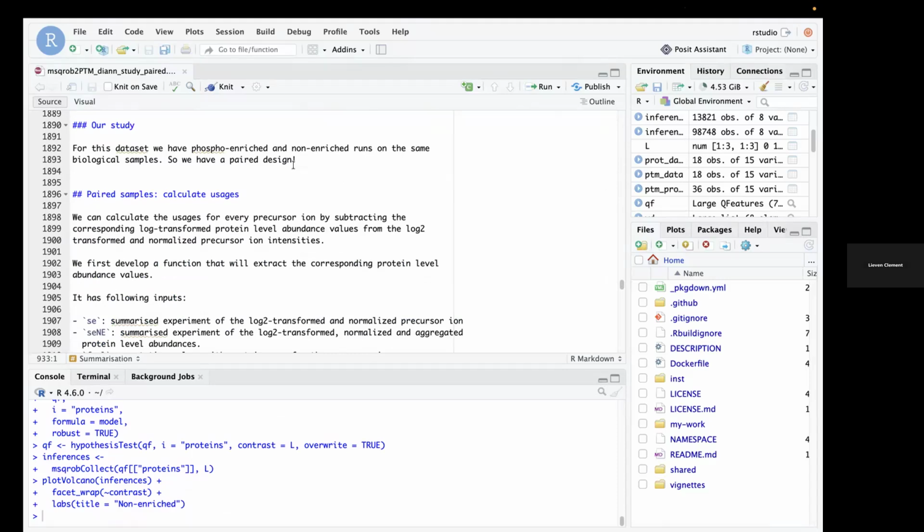Where there is no modification whatsoever at the protein level and then you have modification. Yeah, then I would go for differential detection. And in msqrob2, we can use a hurdle model, and that fits two components: presence or absence, and differential abundance, given that abundance occurs. Then instead of using the msqrob function, you use the msqrobAggregate or hurdle function. So that's what you do.